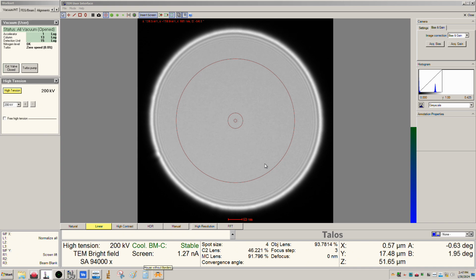What we're going to do is go find a place to take some images, and we're going to play around with this current and watch how we can alter the appearance with changing this dose. Okay, so let me pull back over here to the left.